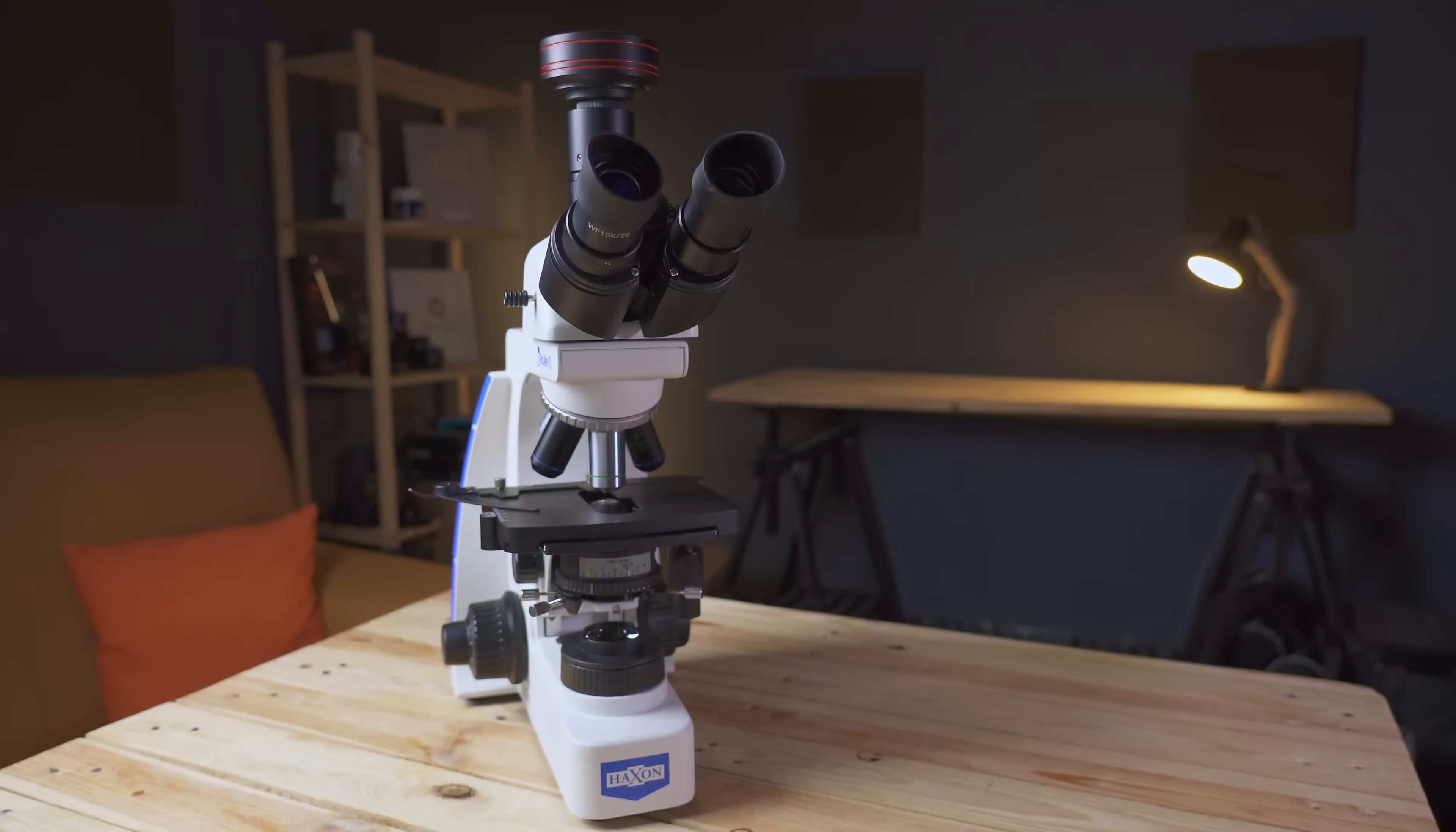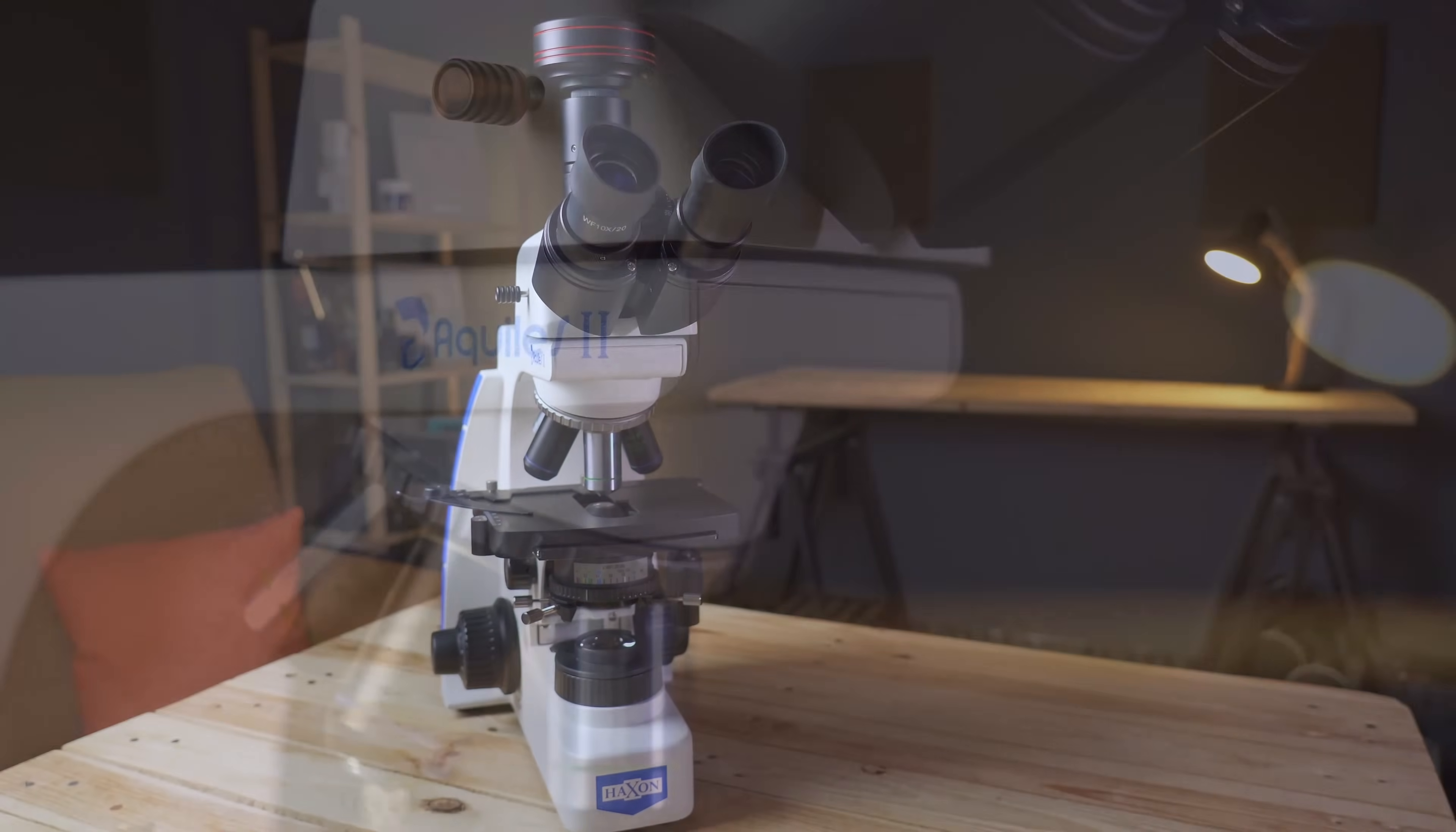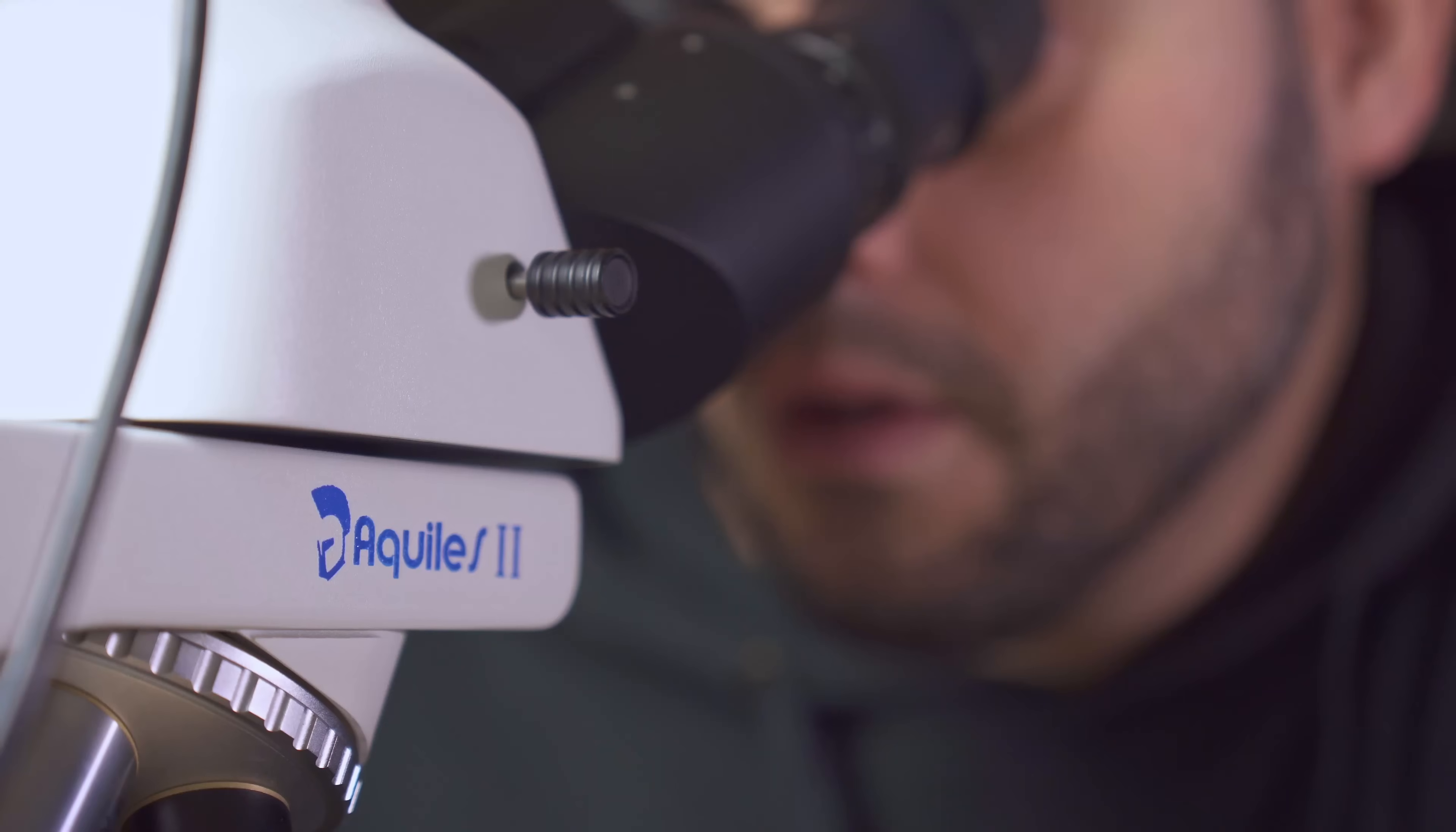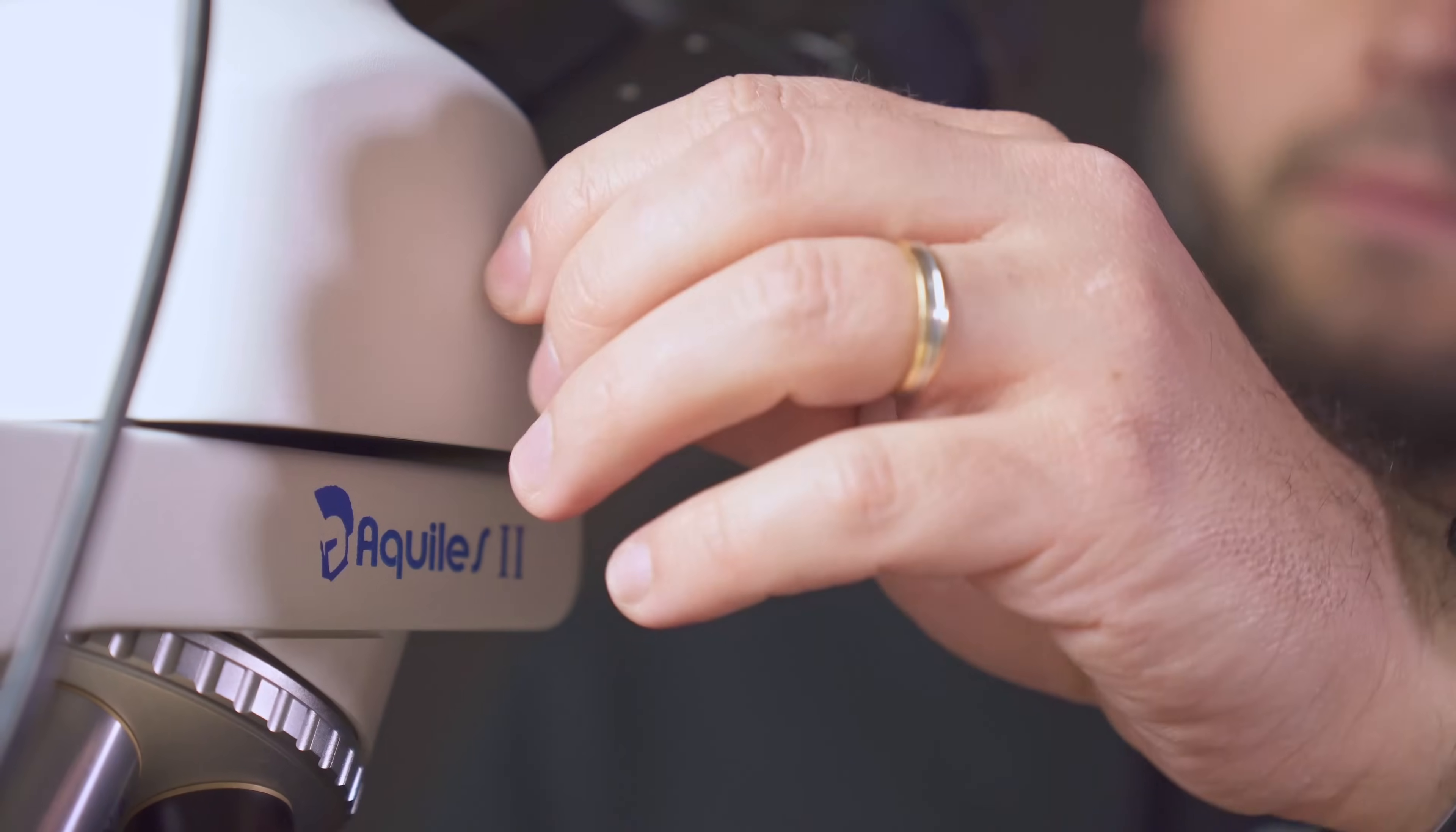What I have mounted here is an Axon Aquiles II trinocular biological microscope with phase contrast. A microscope especially aimed at the world of microphotography, because it allows the light beam to be directed directly to the camera without needing to reflect it in prisms or pass it through lenses.